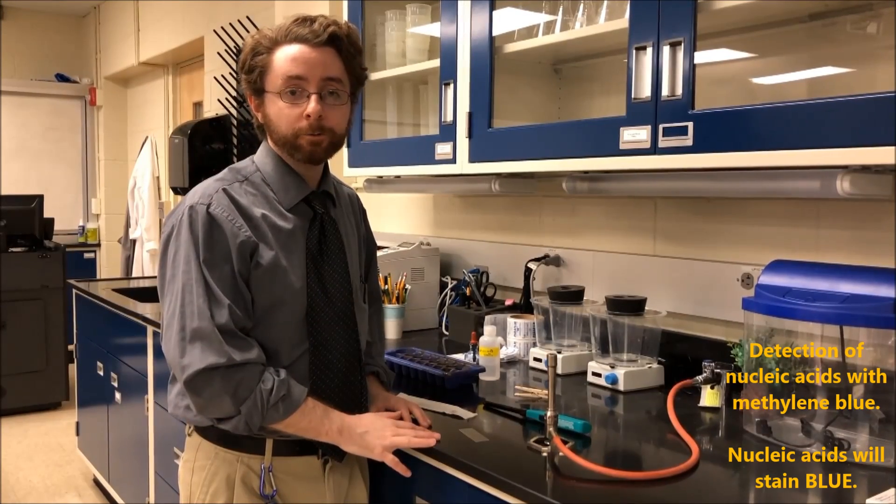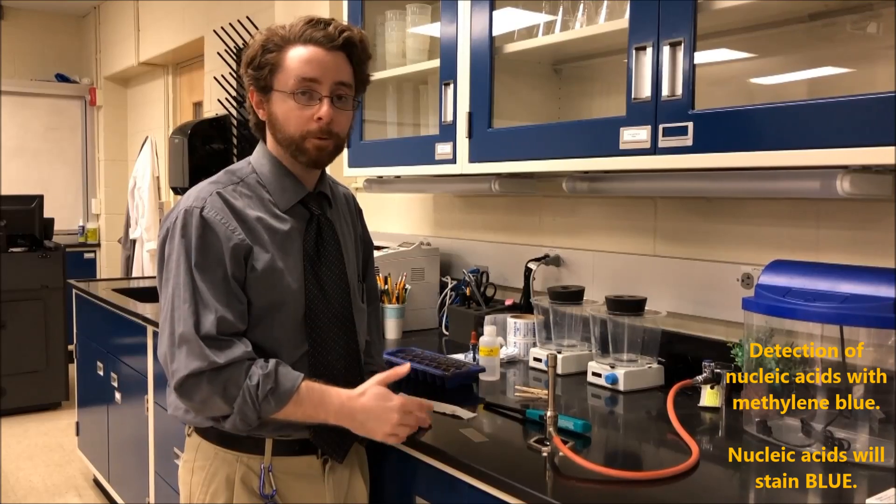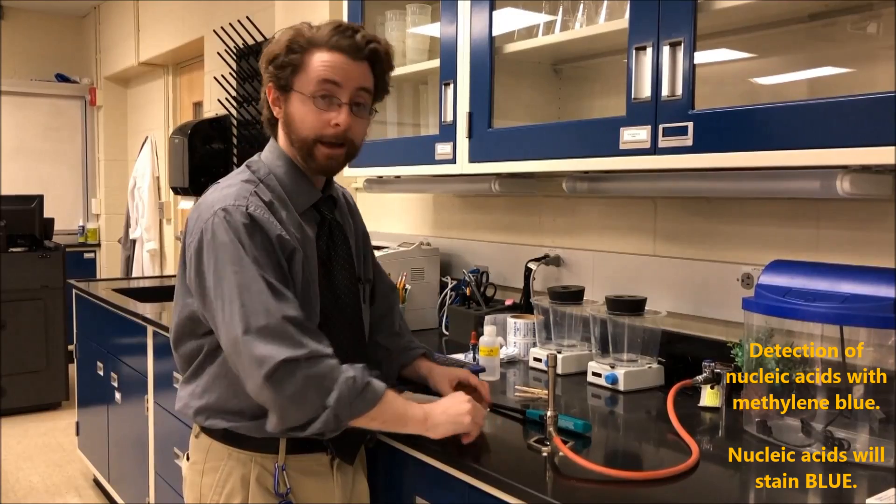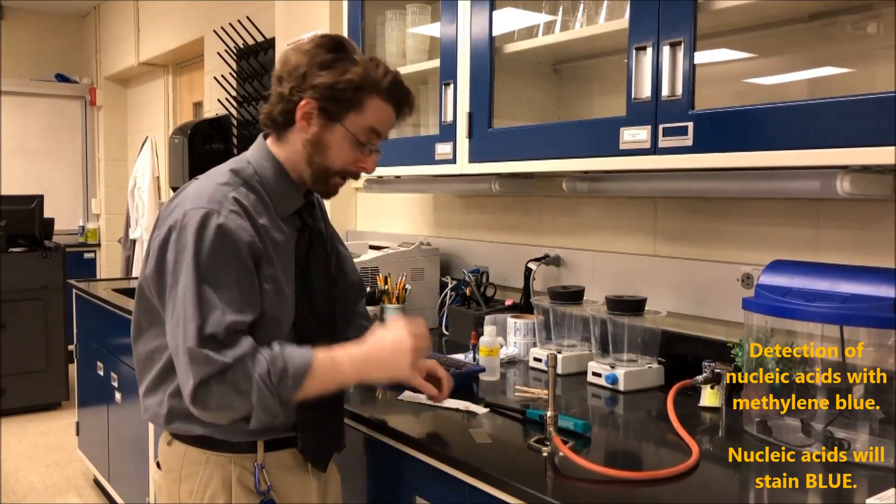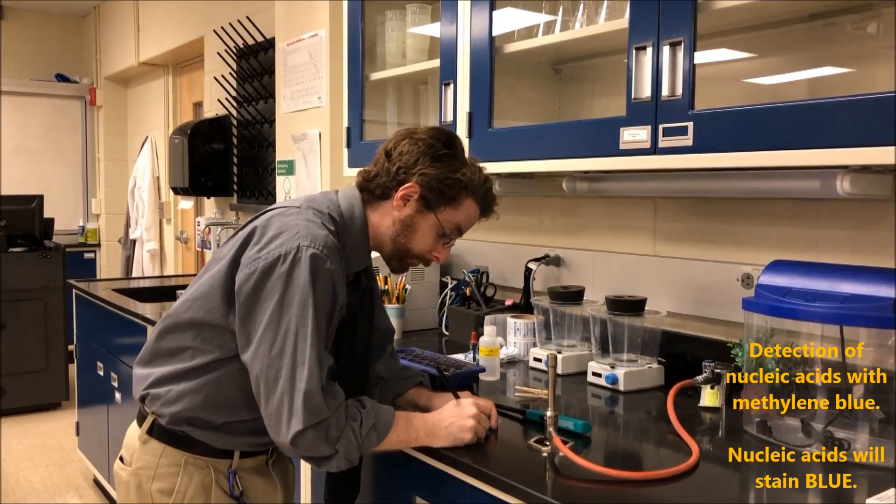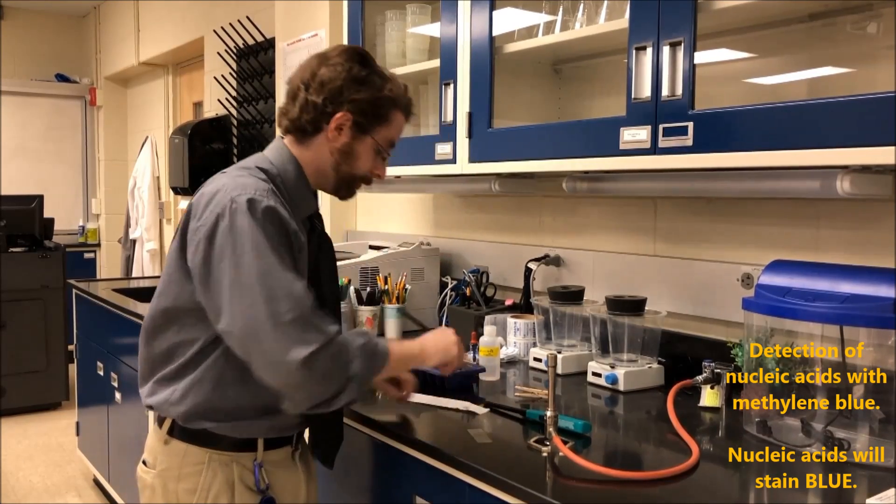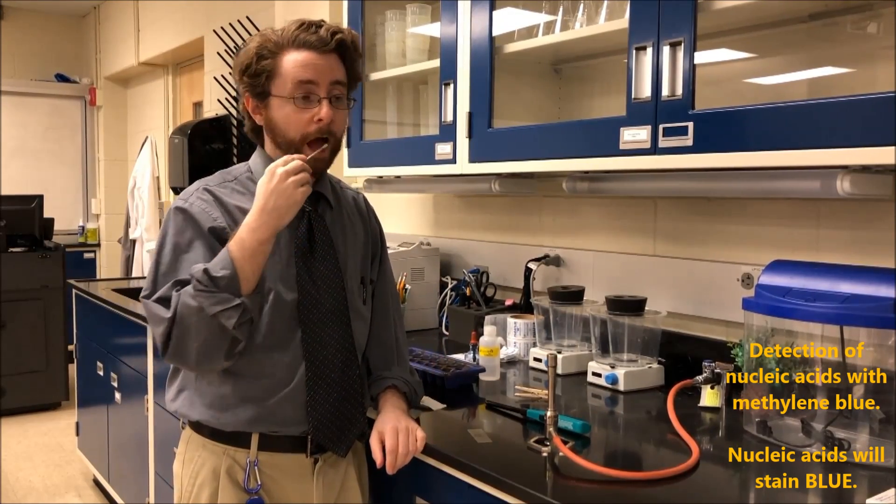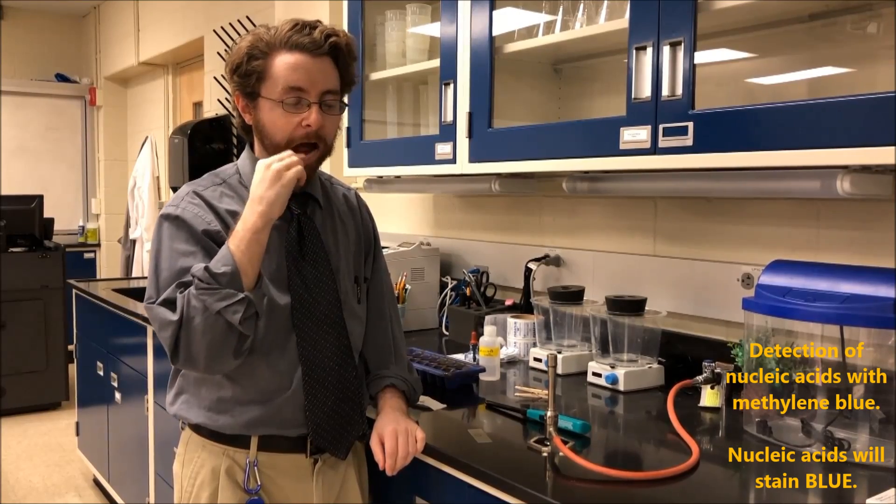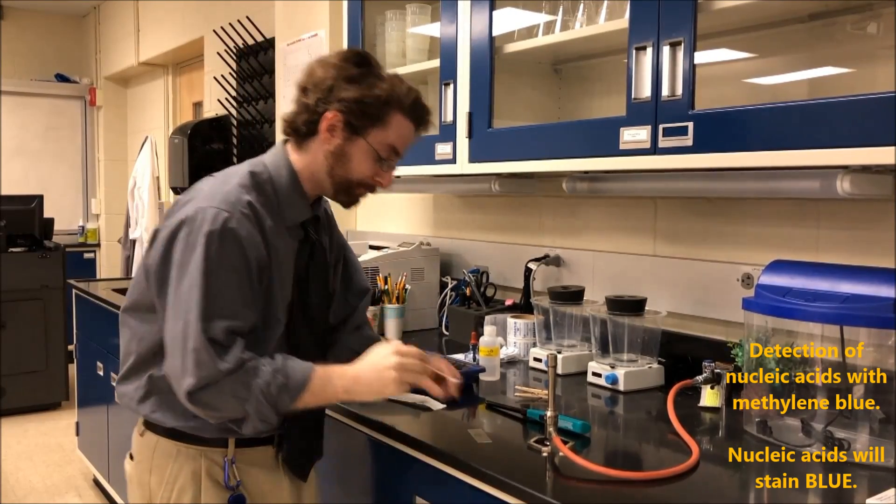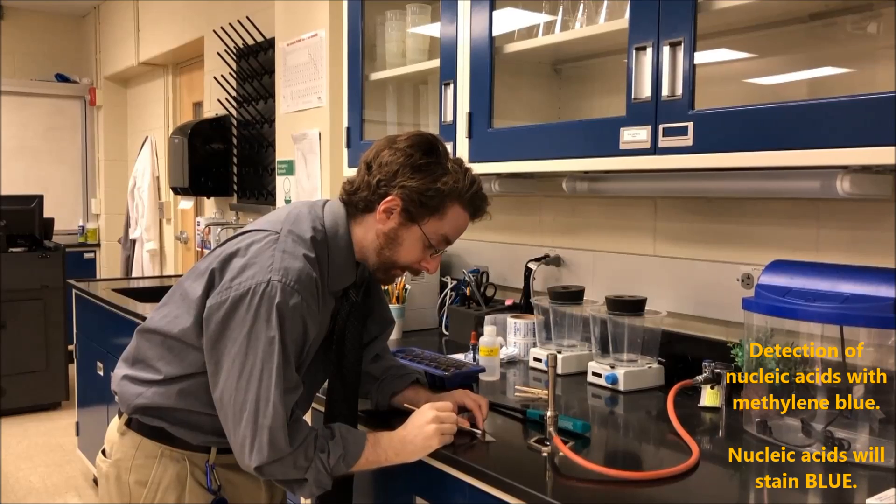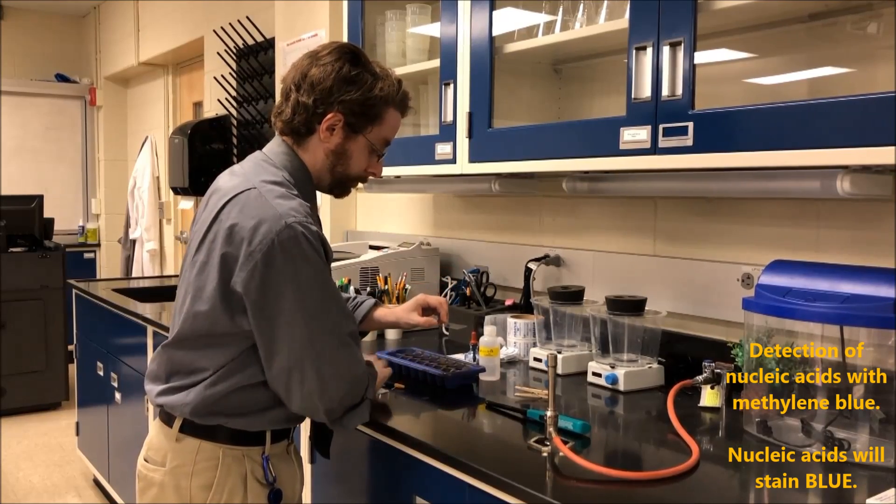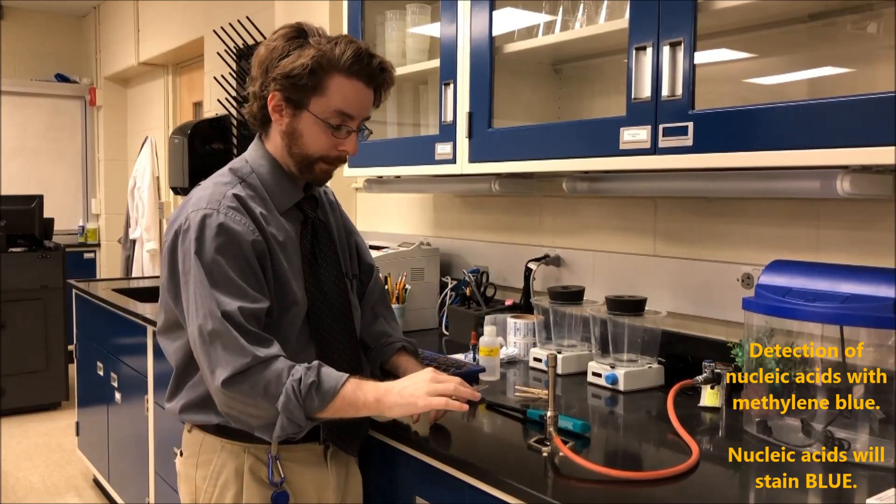To look for nucleic acids, we can use methylene blue. And an example with methylene blue we can use is staining cheek cells. So I will take a glass slide and my wax pencil and I'm going to draw a circle. And then I'm going to take a sterile swab and swab for some cheek cells. And then I'm going to smear it into my circle. Allow that to air dry for a second.